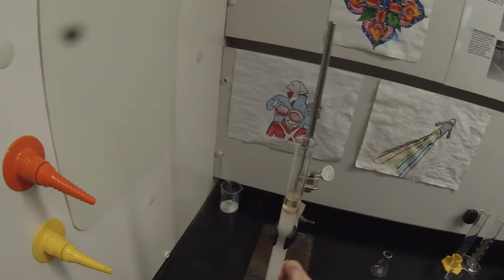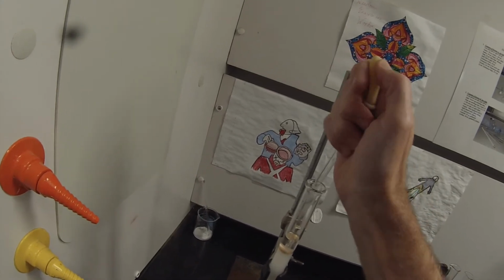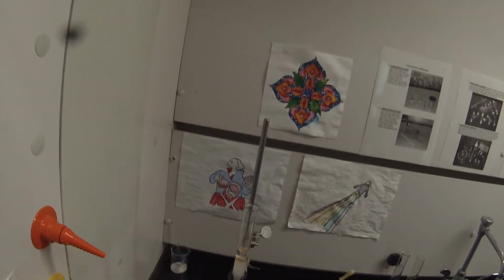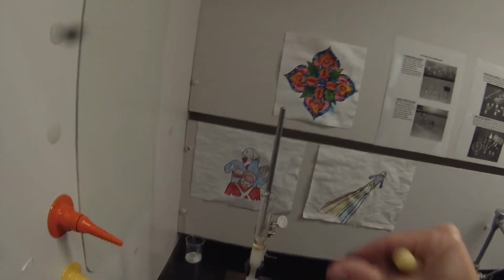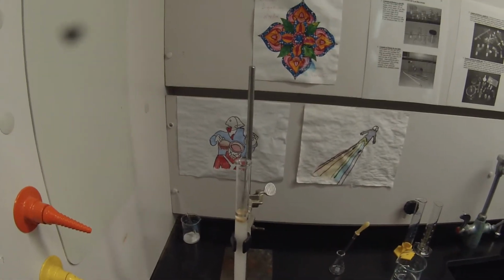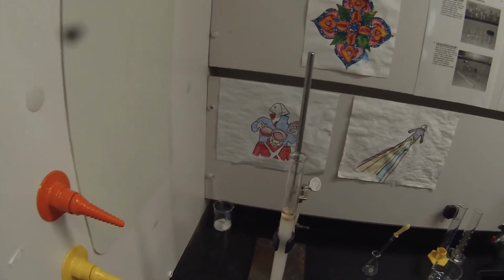And this pipette is for my pet ether. There's a little bit of silica around the walls still. Drag that down. So I don't really want to use any more volume, even though it's not completely dissolving. Let's put that on there.